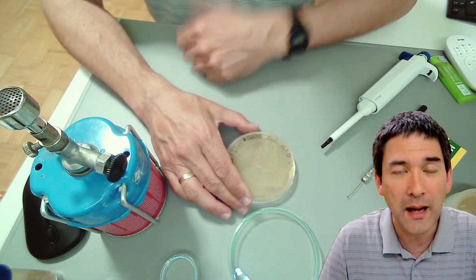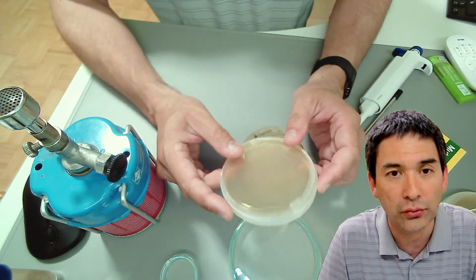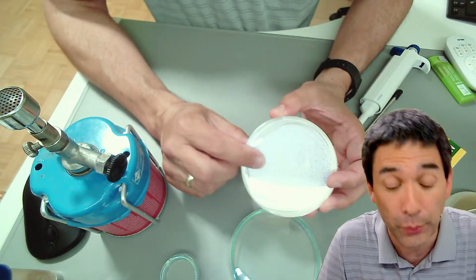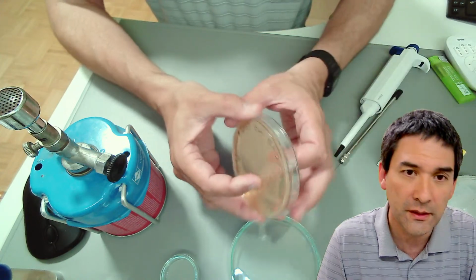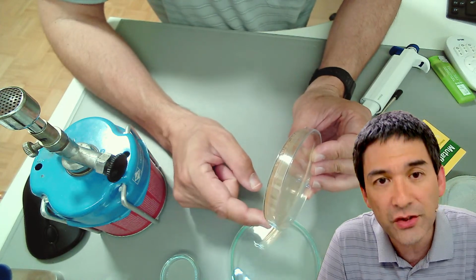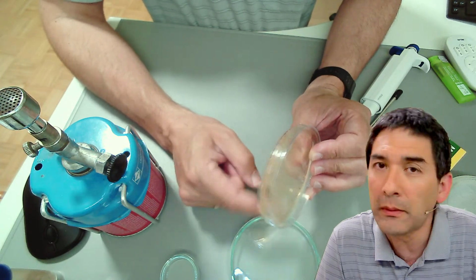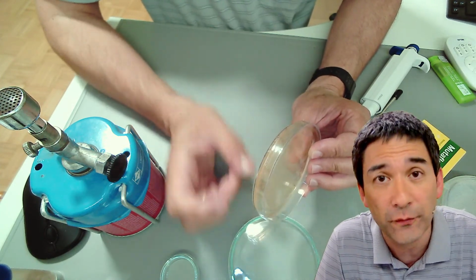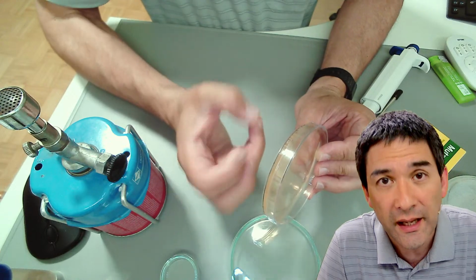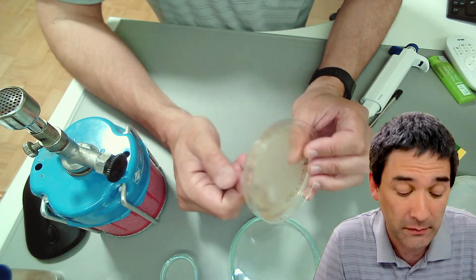So first of all, I'm going to give a very brief introduction. Bacteria these days are grown in petri dishes, and those petri dishes have a lid, which is obviously very important. In here, this colored material is the so-called growth medium, which contains nutrients for the bacteria to grow. There are hundreds, if not thousands, of different recipes for this growth medium, for different purposes and different bacteria. It is a very gel-like substance. It's like gelatin, but not gelatin, a very solid gel.